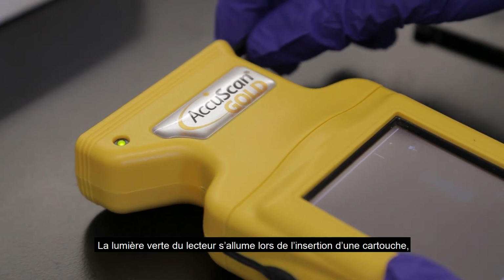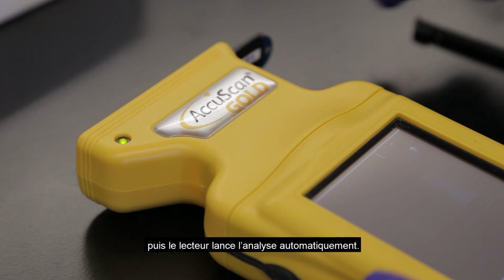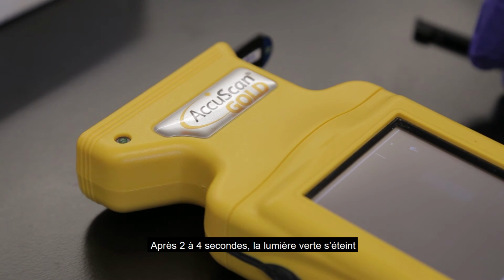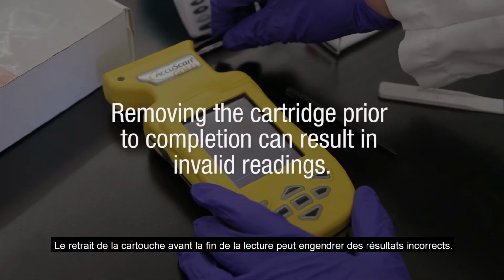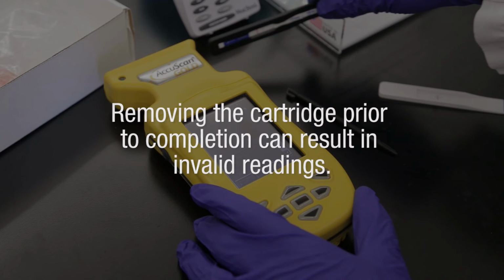The reader's green light glows when a cartridge is inserted. The reader automatically begins analyzing the cartridge. Within 2 to 4 seconds, the green light turns off and one beep indicates the completion of the analysis. Removing the cartridge prior to completion can result in invalid readings.